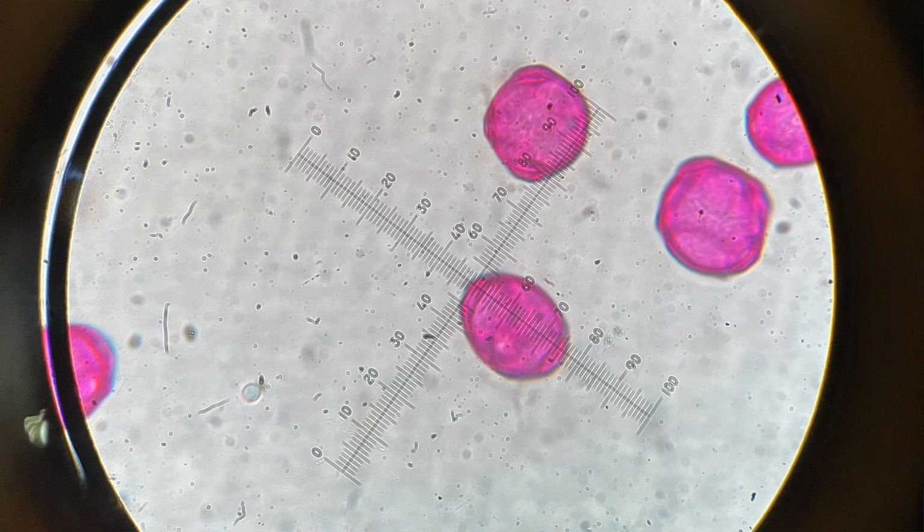So you see the differences, mainly the shapes, the sizes. That's what you'll see the most obviously.